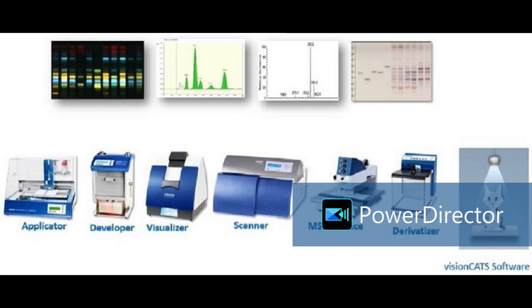We can hyphenate HPTLC with others. The literal meaning of hyphenation is adding a hyphen between two techniques: LC-MS, HPTLC-MS, LC-MS-MS, GC-MS-MS. Hyphenation is the addition of two or three techniques together for more sensitive, accurate detection and separation.